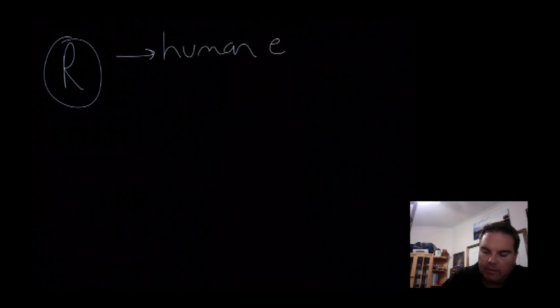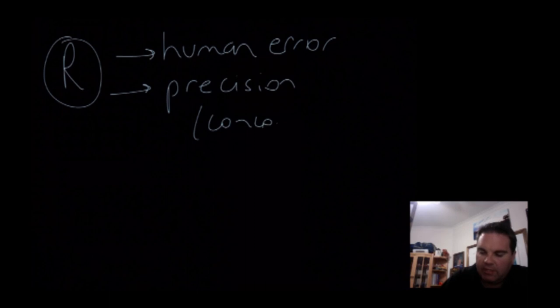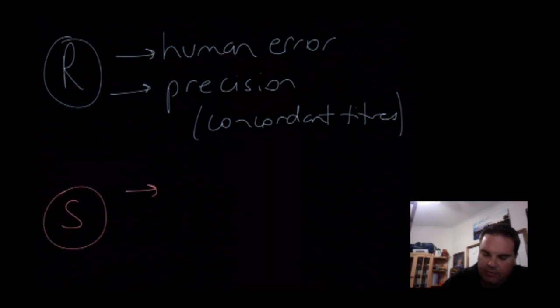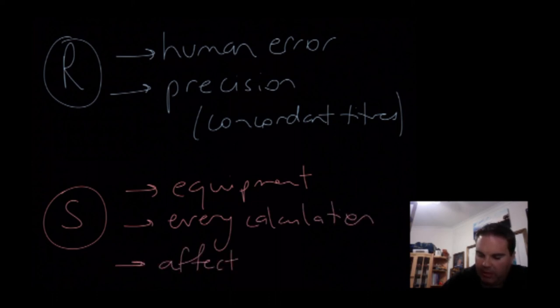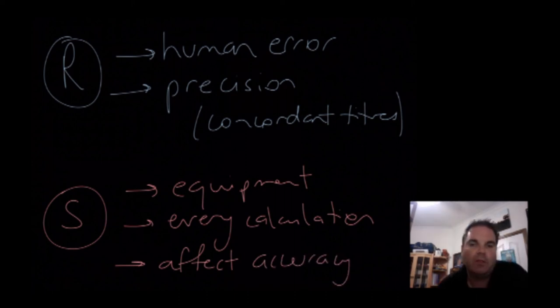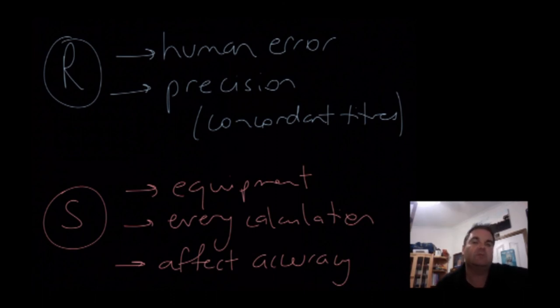To summarise: random errors are generally due to human error, and they affect your precision - your ability to get concordant titers. Systematic errors are generally due to equipment, they affect every calculation, and they affect your accuracy, which is your ability to get close to the actual true value. Hopefully this has been helpful. I haven't covered absolutely everything that could go wrong, just some of the common ones. I hope this helps with your prac write-ups and understanding some of the issues you can have. Thanks, guys.